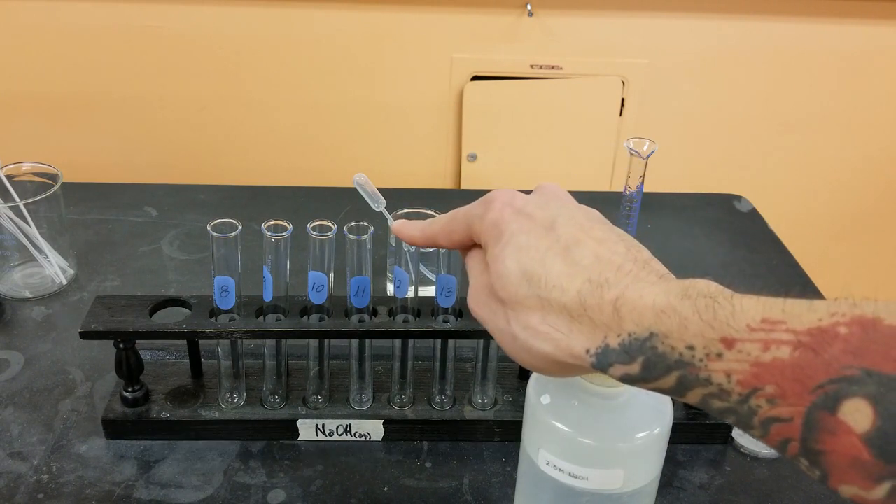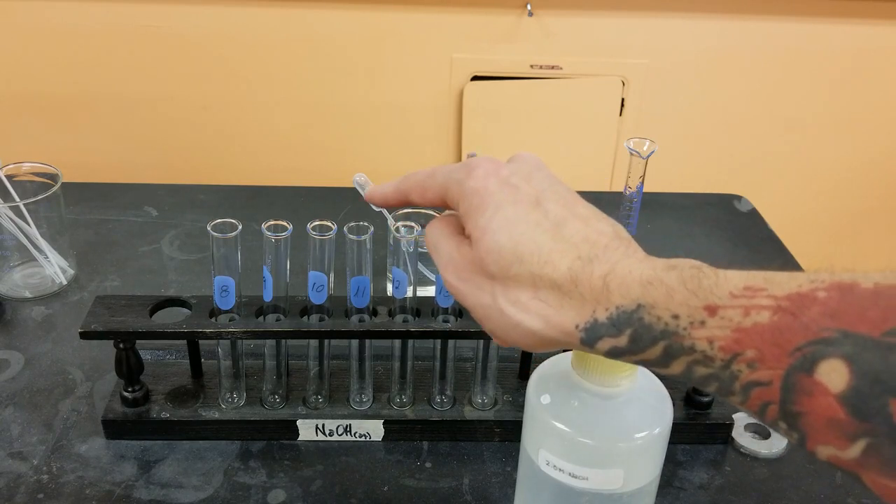Test tube 12 will be 9 milliliters of water and 1 milliliter from test tube 13. Test tube 11 will be 9 milliliters of water and 1 milliliter from test tube 12.